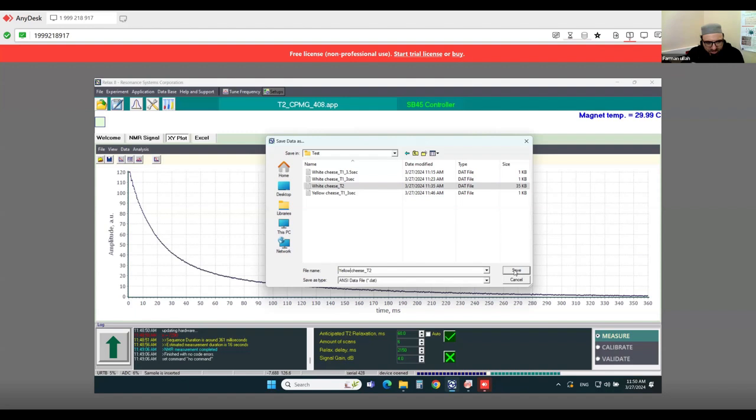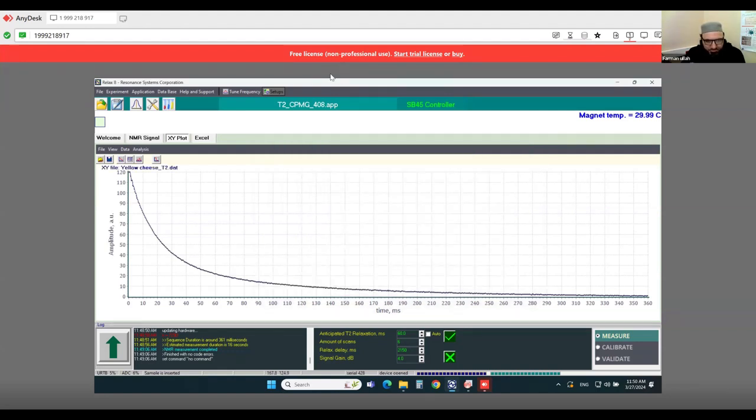If somebody has any solution to this problem, that the fitting curve is not shown here, you can mention it in the comments. My only solution is to copy the data to another software. Yeah, okay. Sorry, it's not very constructive. Okay, so I have saved the sample data.